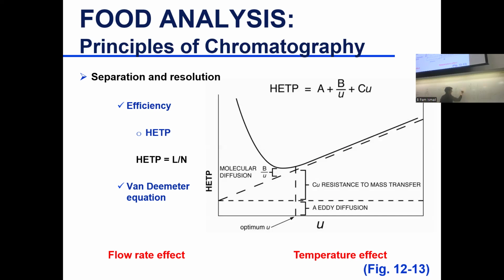In GC, you really see sharp peaks. In HPLC, the peaks are a little wider. Because with a capillary column, the compounds going in don't have a lot of room to go into the stationary phase and be lost. Because you have a very thin layer, you reach equilibrium very quickly.